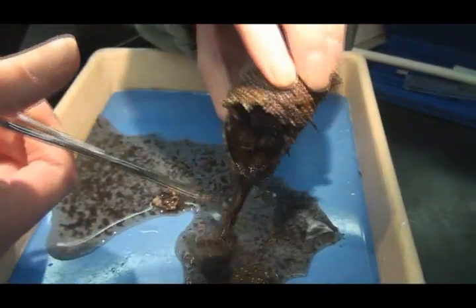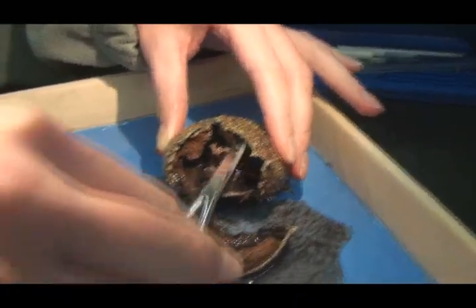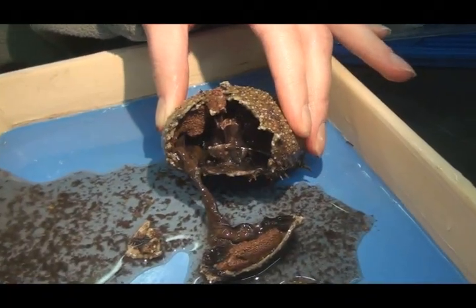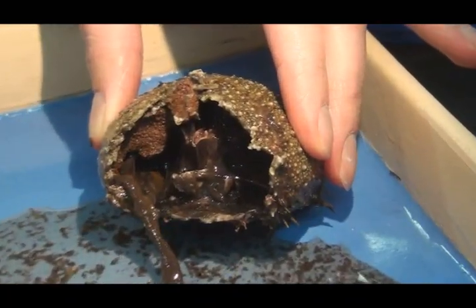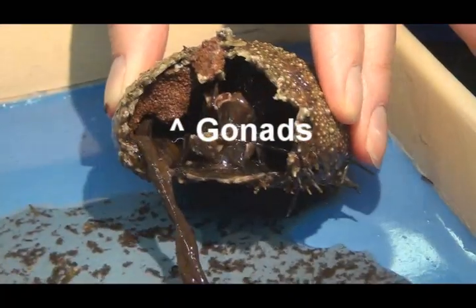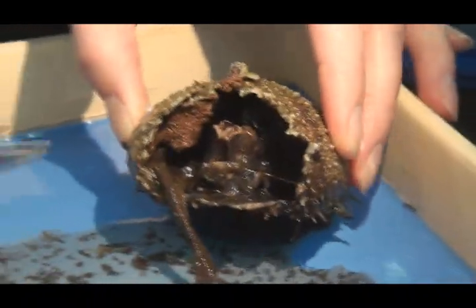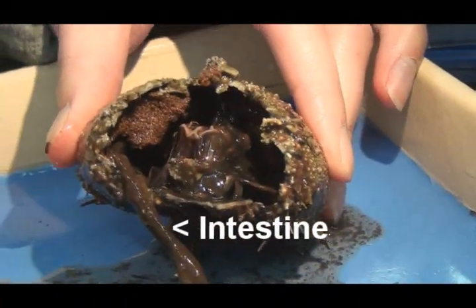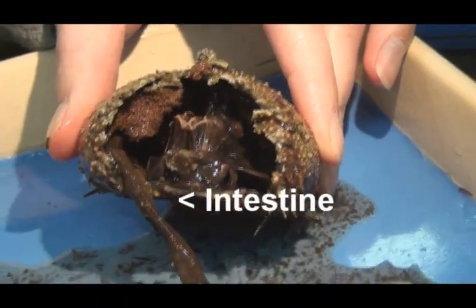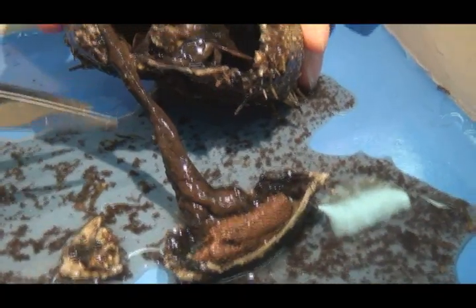Snip some more away so we have a clearer view. Beautiful. In the top left, we can see some gonads. Feel free to remove some for better visibility. Coming out of the same side, we can see the intestine. This one's nice and shiny.